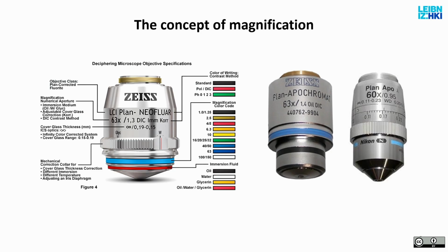So my sample could be, for example, live imaging or cells in a petri dish, in which case they are basically in water or saline. It could also be a sample which is, for example, in Vectashield, which has a refractive index of about 1.4, 1.41, 1.44 that corresponds to glycerol. And in this case, you would actually put glycerol as an immersion.